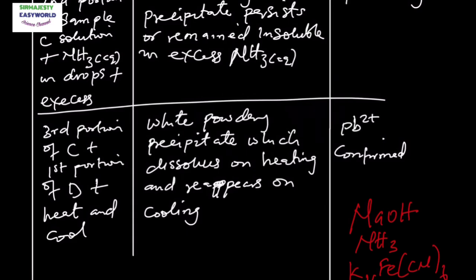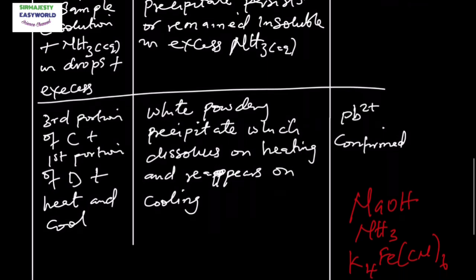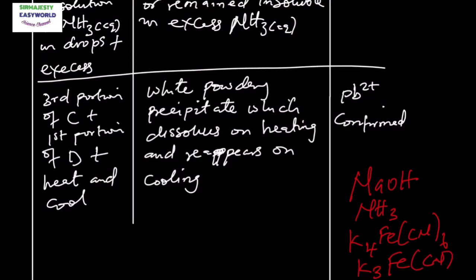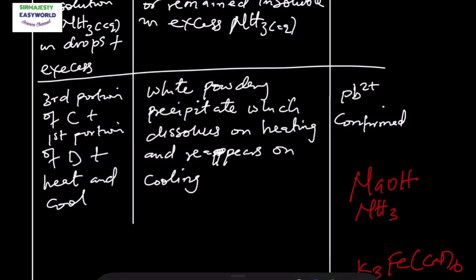This is the ferrate-2. But sometimes, I think the thing the follower sent to me, they gave us ferrate-3. So we will assume it is no mistake, and this is the formula for ferrate-3, K3Fe(CN)6. So this one on the screen that I did not clean is what we were asked to provide, but you don't actually use this to test for iron-3 because it's already iron-3.